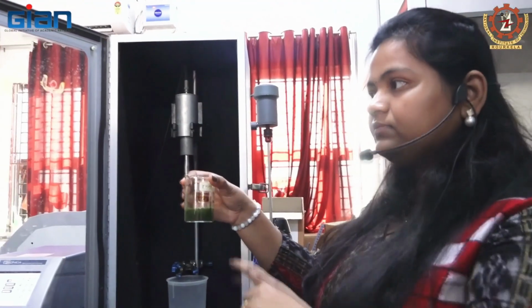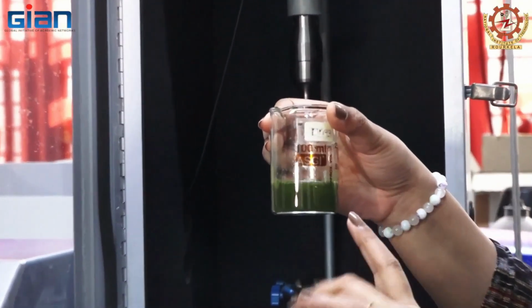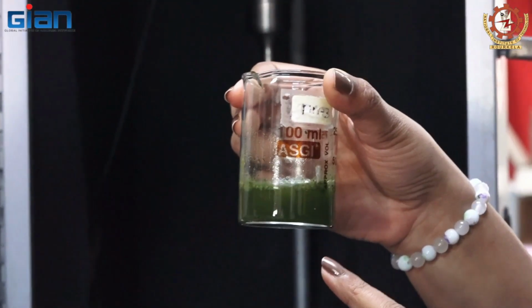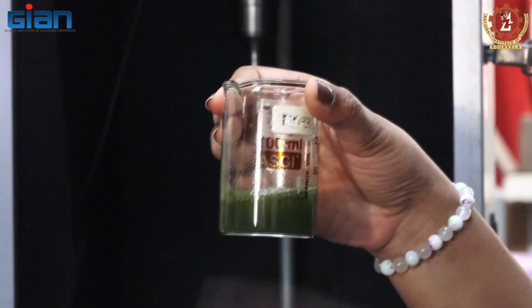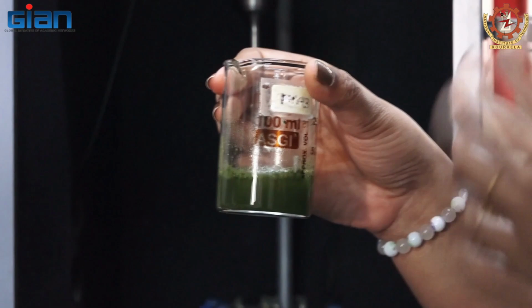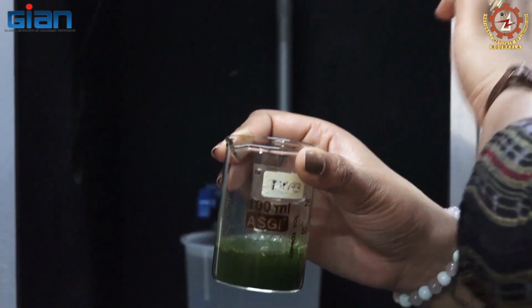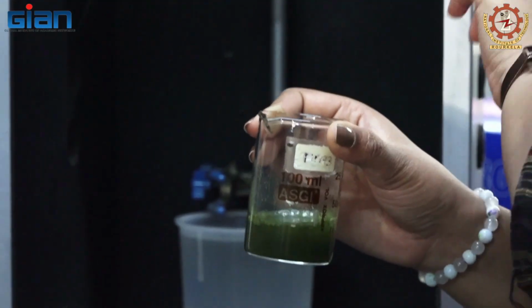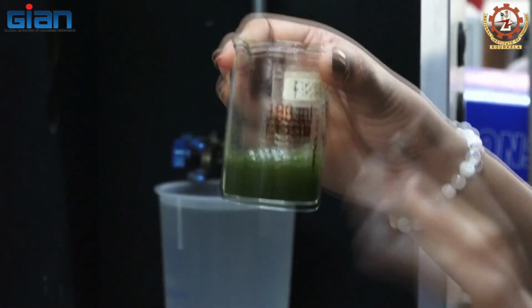Now I took the solvent as water, because we all know that water is the universal solvent. Then you can take any polar, non-polar, any type of solvent you can use for the ultrasound. That's why it is known as a very emerging technology. It has versatility, any kind of solvents you can use.